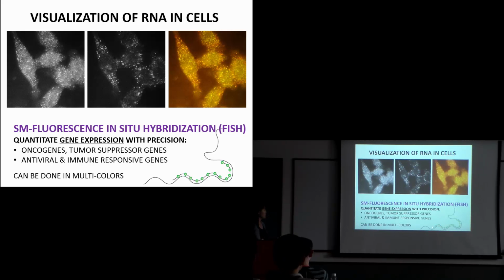These black lines represent oligonucleotides, or DNA strands, that would be complementary to your mRNA target. Each individual one is fluorescently labeled, and you prepare 30 to 40 of these probes to bind to an individual mRNA. Therefore, it's very bright in our imaging microscope.